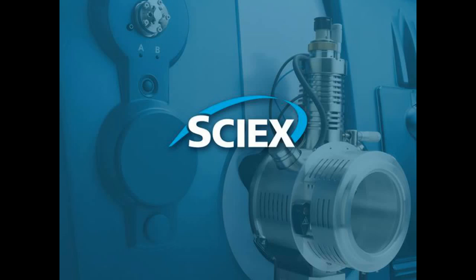We have another question. The loading volume of CE is low. How does this affect the sensitivity of this technique compared to LC-MS? Good question. I think really it's all about a combination of ion generation as well as loading. If you look at high flow, you're running there at a couple hundred microliters per minute. Your ion generation is relatively poor because you have to get rid of all the solvent, but you can inject 10 microliters. With CESI-MS, basically you're now running at 30 nanoliters per minute, or less in some instances.